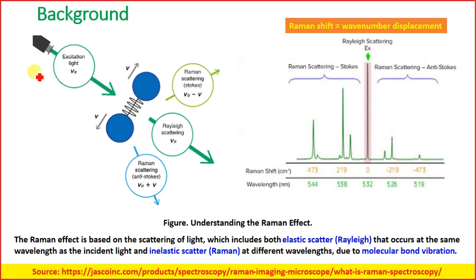In Raman spectroscopy, we use a laser source. In fluorescence spectroscopy, we may use a laser source, or we may use normal lamps, from where we can decompose the signal and convert the polychromatic light to monochromatic light.